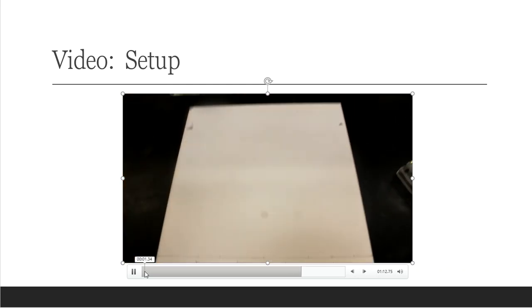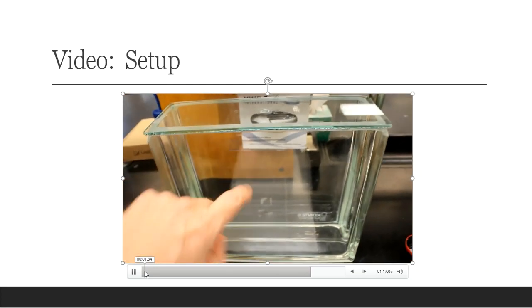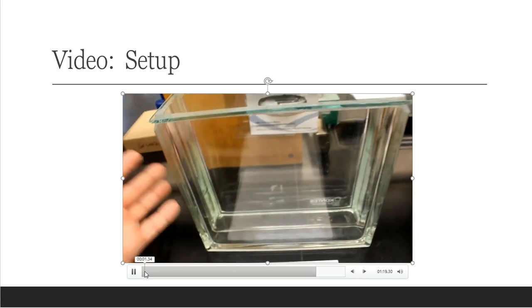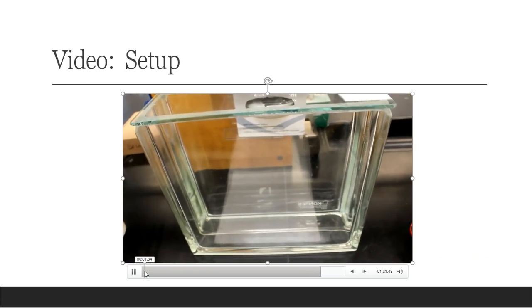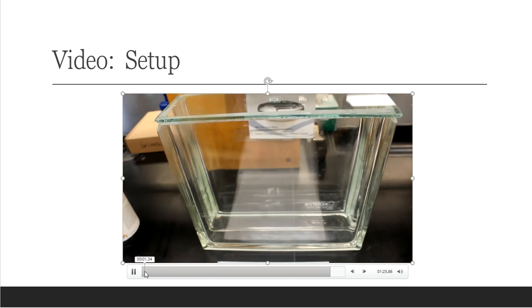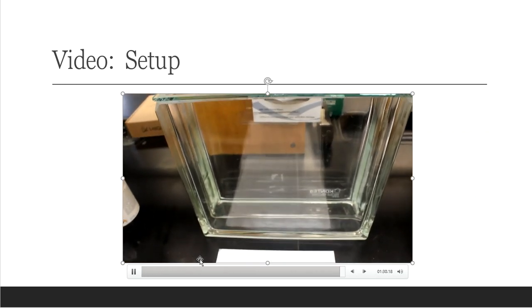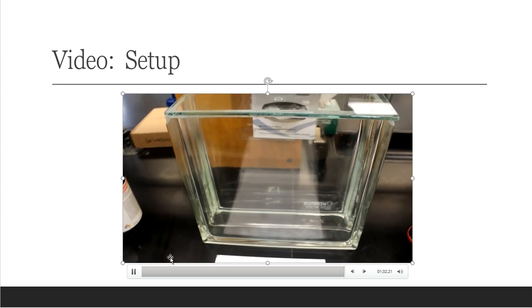So now I'm getting ready to take my plate and I'm getting ready to put it into the TLC chamber that's back here in the back. These things are super heavy. It's very thick wall. We put a lid on it to prevent evaporation from the solvent, but that is the TLC chamber that we will put our plate inside of. And then we just let it hang out for a little bit until it gets finished.